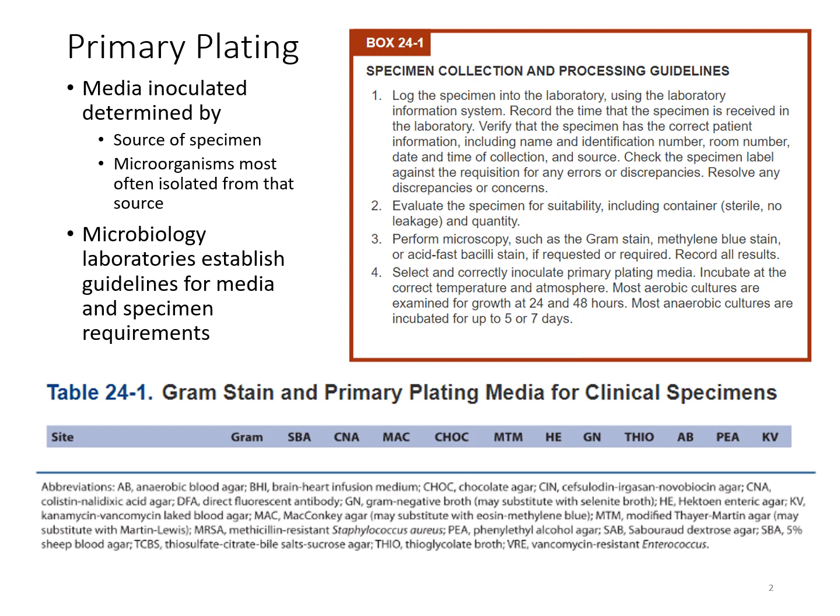And so we'll learn a little bit more about the various organisms that would be cultivated using this particular media, but for now what we're going to look at is the particular specimen and what you would culture it on, and start understanding why you are doing the cultures in this manner. So we're going to start out learning based on a specimen and what typically grows in that specimen, and then we're going to dive a little deeper into those particular organisms that would typically be found in those specimens.